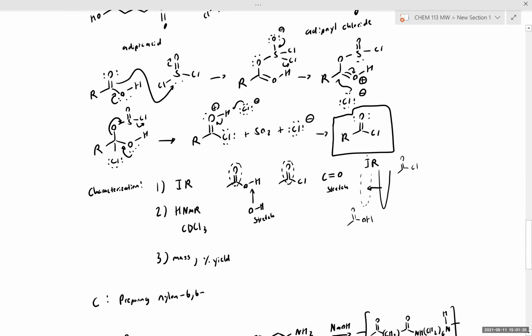And that's why in the spectra that I provided you, I show an overlay between the adipic acid and adipoyl chloride spectra. So you can see that the reaction has gone to completion as our carbonyl CO stretch has shifted in wave number value.